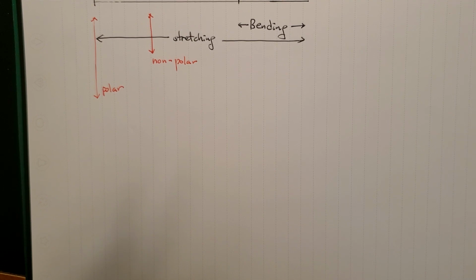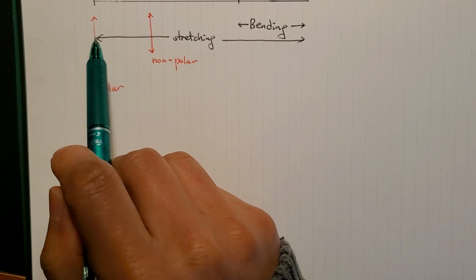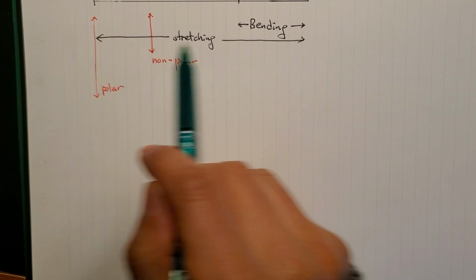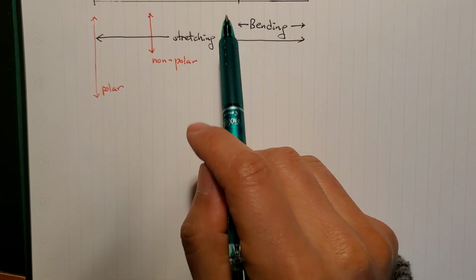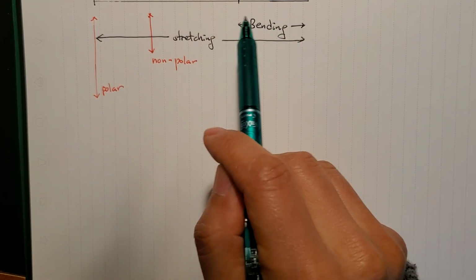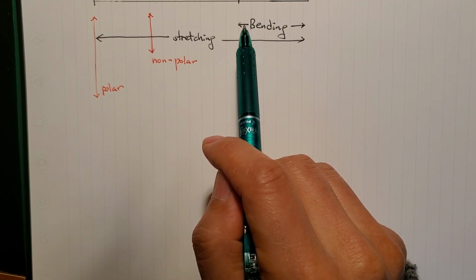Today in this video, we'll talk a little bit more about relatively weak signals. As you know, the stretching vibrations come all over the place, and the bending vibration starts around 1450 with a CH, one of the highest frequency bending vibrations.